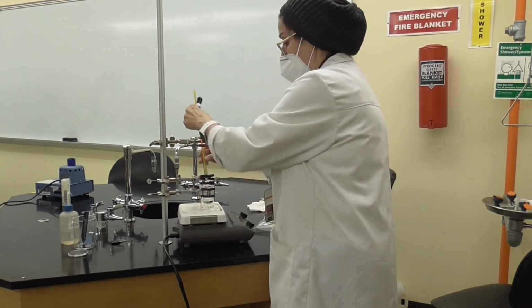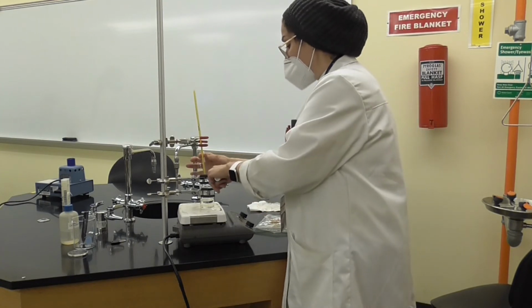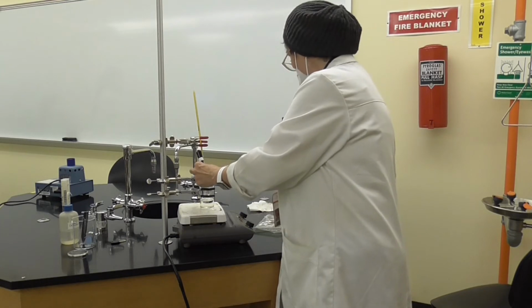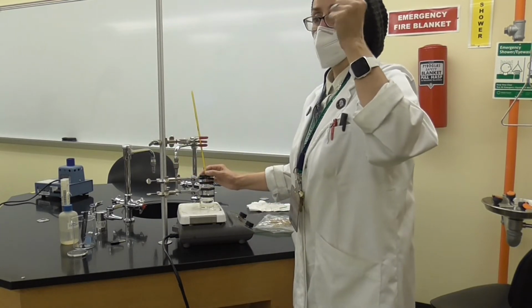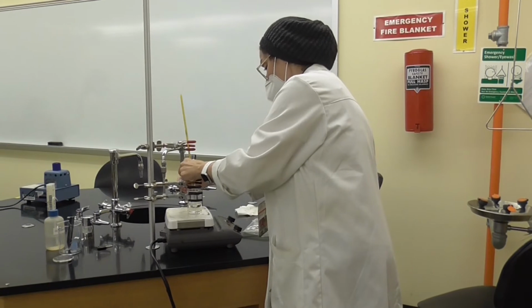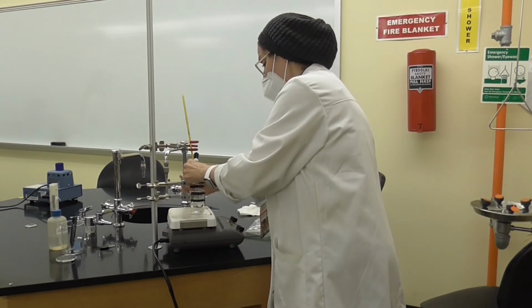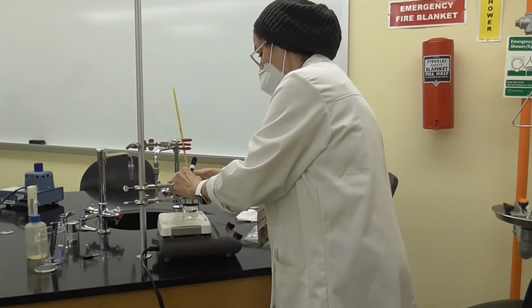What we have is this Pyrex test tube, a small test tube, and inside the test tube, I put one of those capillary tubes upside down, okay? Then I'm going to insert the tube here, and hold it, making sure it is held properly.